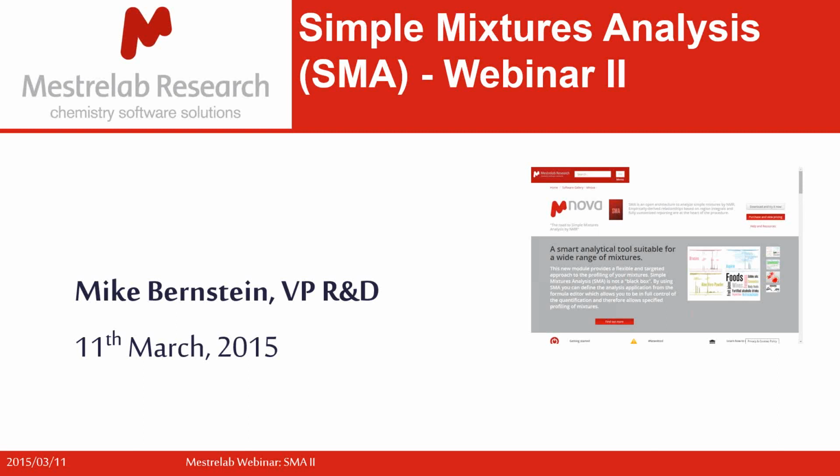So let's dive in. We've got quite a bit to get through today. I'll go through this early stuff which relates to the first webinar, as I said, and then I'll go through some PowerPoint slides that show you a lot of what has to do with the SMA setup for particular experiments, and then I'll give you some examples so you'll get a rounded view today.